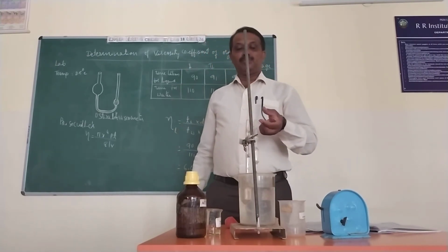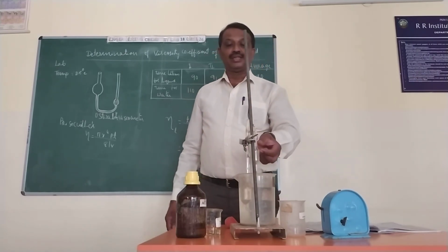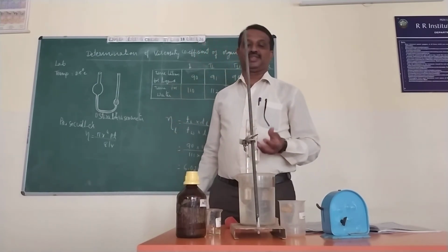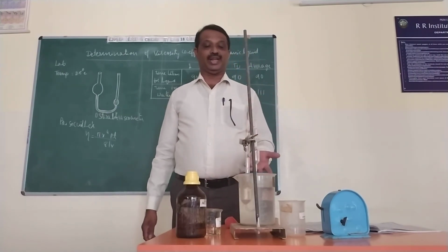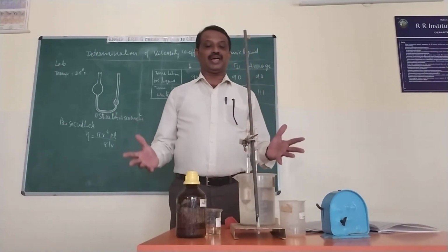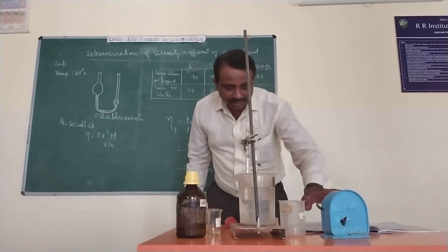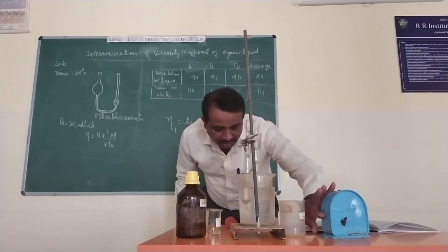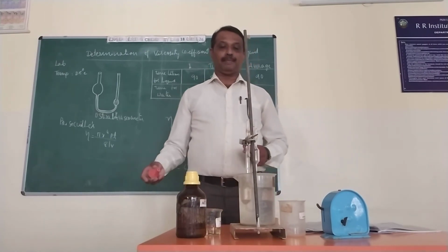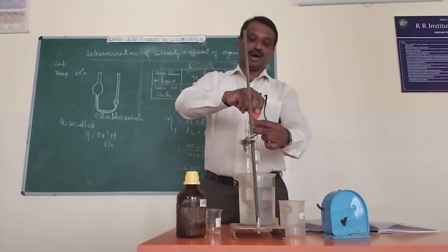At that time, for the movement of the same liquid, the time is different, from the upper mark to the lower mark. Within 1 or 2 minutes, the temperature may vary by 1 or 2 degrees, but since we have kept it in the water bath, it does not have a maximum effect on the movement of the liquid. So from coming to this last end, about 112 seconds have passed. I can repeat one more time, transferring from the larger bulb to the smaller one.